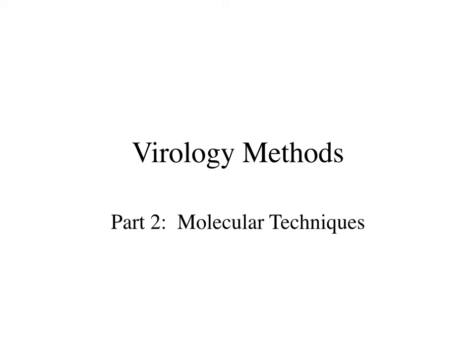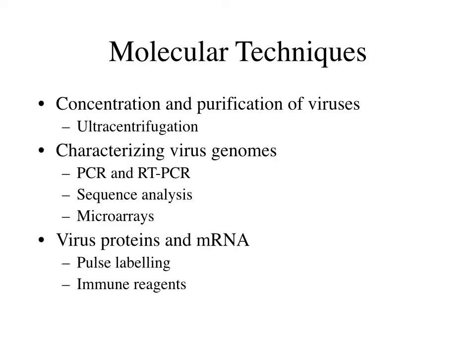In this lecture, we're going to look at molecular techniques that are used in the laboratory to study viruses. These techniques can be put into three basic categories: concentration and purification of viruses, characterizing virus genomes, and studying virus proteins and messenger RNA. So we'll look at some of the more commonly used protocols in this lecture.